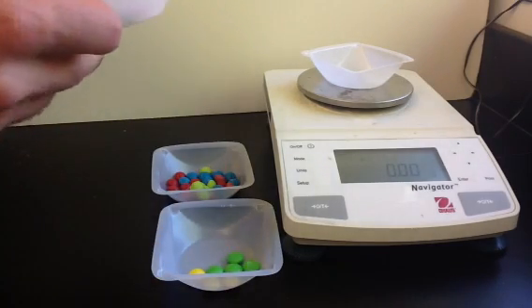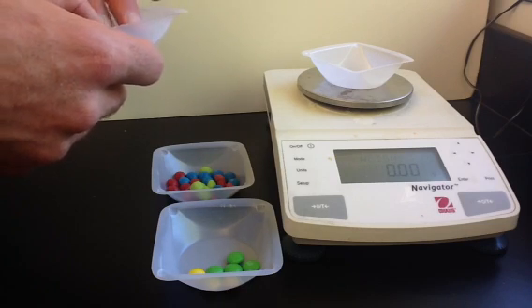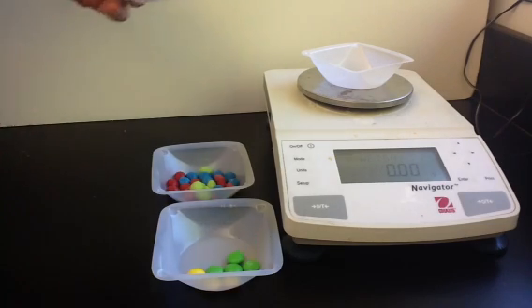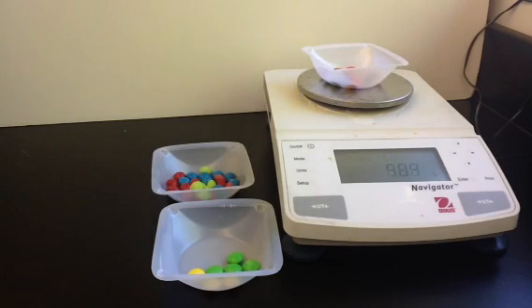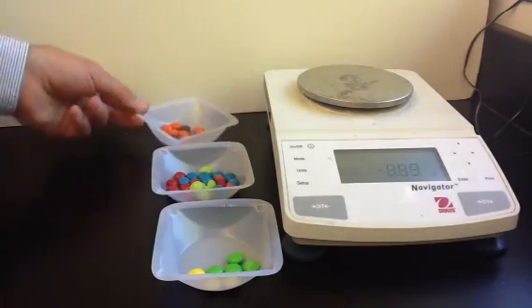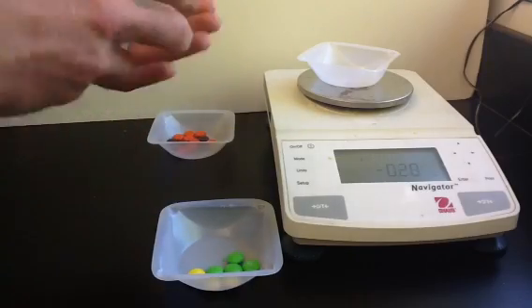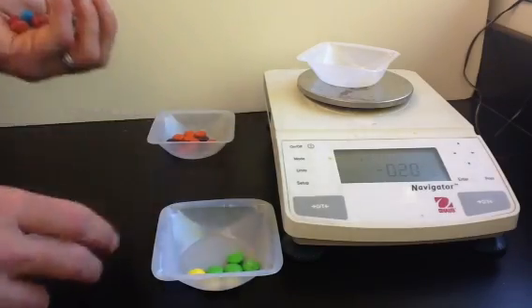We'll do the Reese's next. So there's 2, 4, 6, 8, 10, 12, 13 Reese's. And we'll put those on the balance. 13 Reese's with a mass of 9.61 grams. 9.61 grams. And now our most abundant isotope is the Skittles. So I'll count these out as I'm putting them on the balance here.